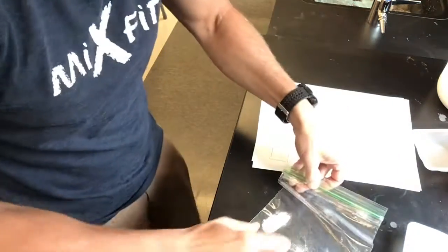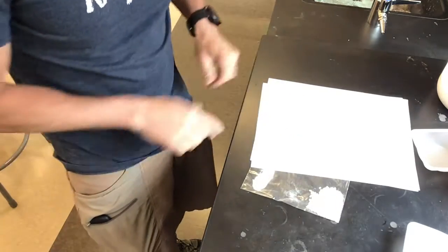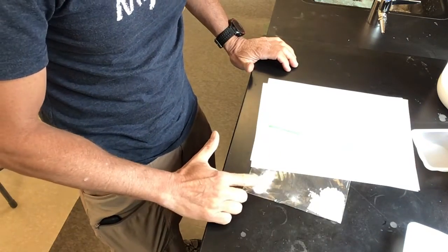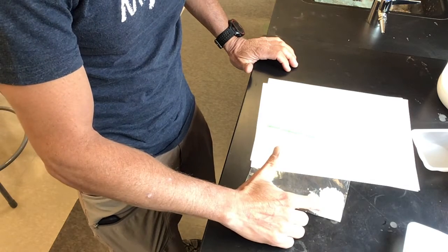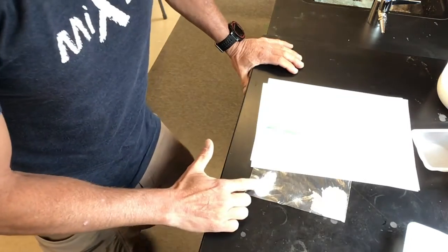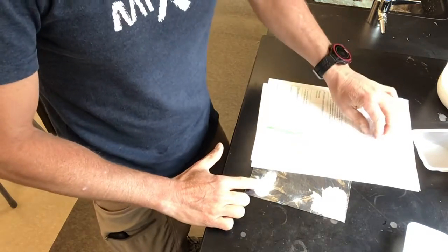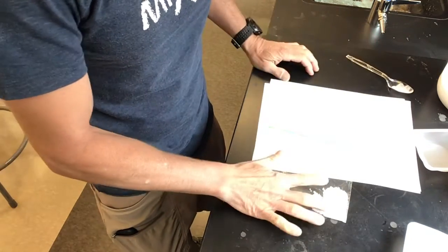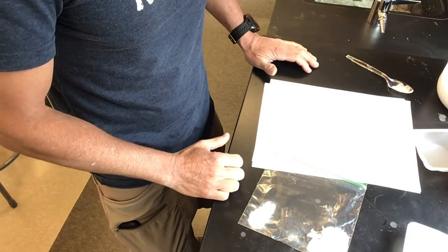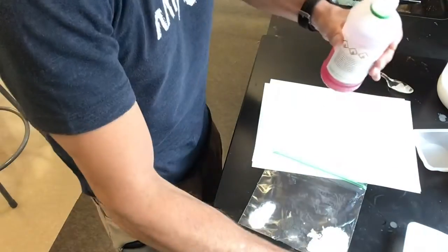So hopefully you'll be able to see this. There's the calcium chloride, this is the sodium bicarbonate: 1.5 spoons of the calcium chloride, half a spoon of the sodium bicarbonate. And then we're going to take some indicator solution, and I'm going to add some of that.